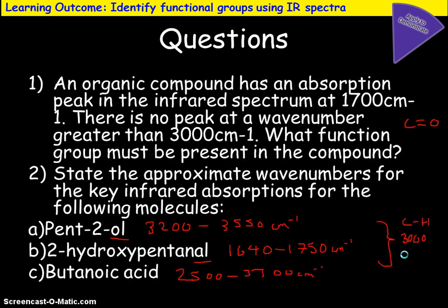If you don't understand any of the things that we've done with infrared spectrometry, you need to make sure that you ask your teacher about it. Have a look carefully at the exam questions. As long as you can look and identify the peaks and use this to make a definitive statement that says simply this functional group is present, then that is going to provide a really powerful tool towards our chemical analysis.